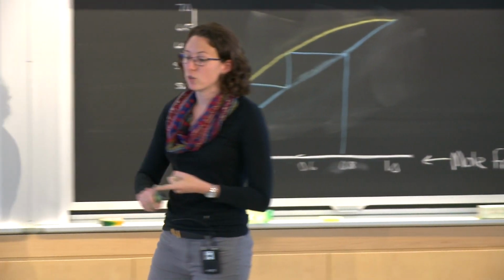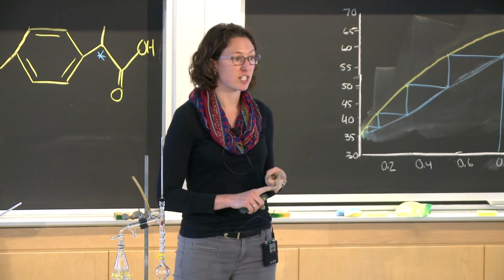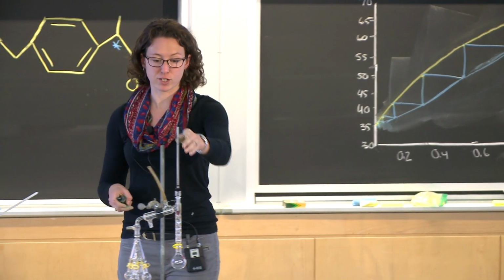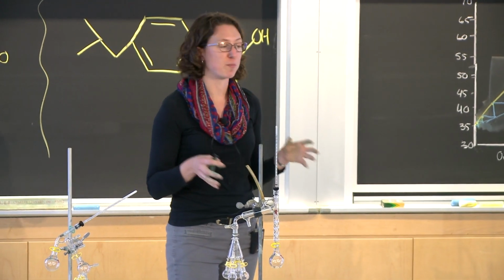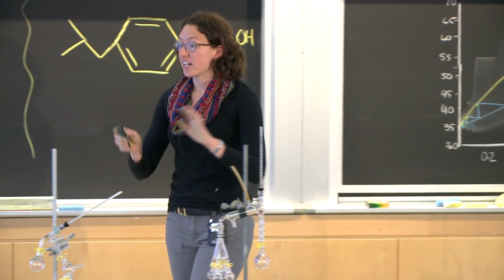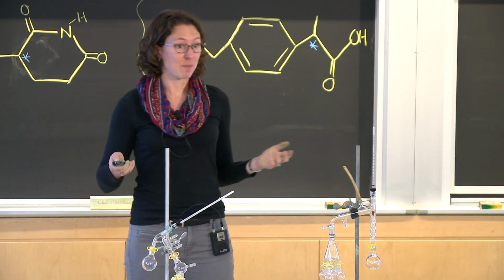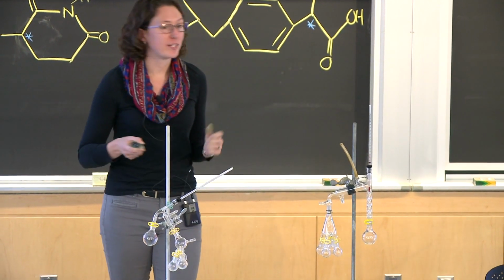So you can use that to predict the temperatures that you will collect your limonene and your carvone fractions, so you know when to be looking on your thermometer to switch your fractions and when you should be collecting which ones, and it'll help you identify what you've collected. So that is all of day 1 of the lab. We made it through day 1 of the 4-day lab, and so then how will we know if it worked?